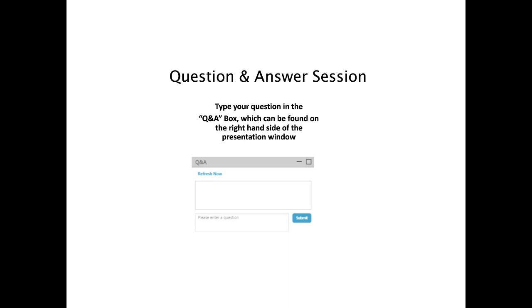Thank you. Another question. What are the overall range and sensitivity limitations of the UHPLC microdetector systems? Yeah, so I can take that one. If you're using UHPLC, there's typically an upper molar mass limit of around 2 million. And for the lower range, we can see about 100 grams per mole. If we're talking about quantifying hydrodynamic radius, then we can measure down to below 1 nanometer.